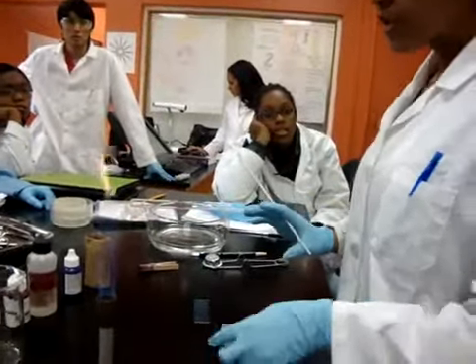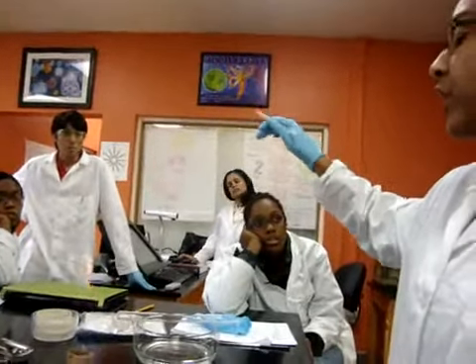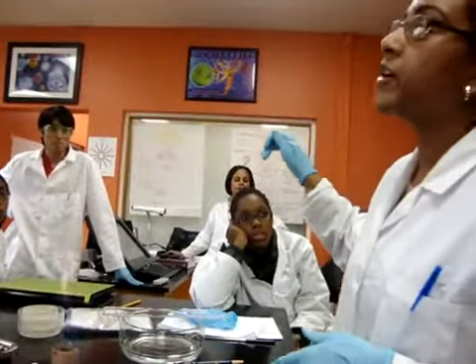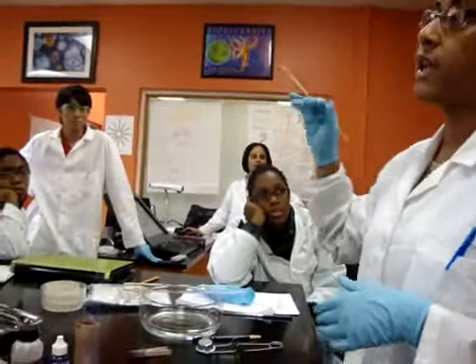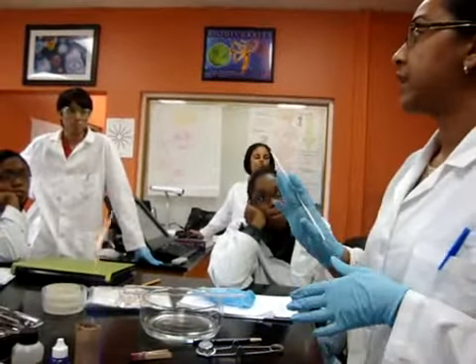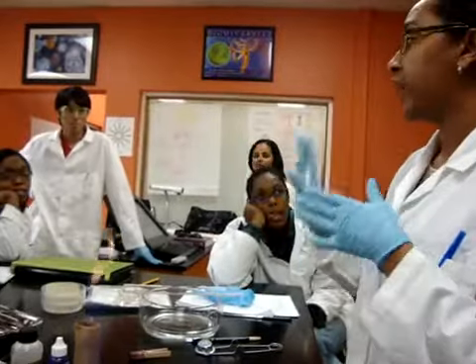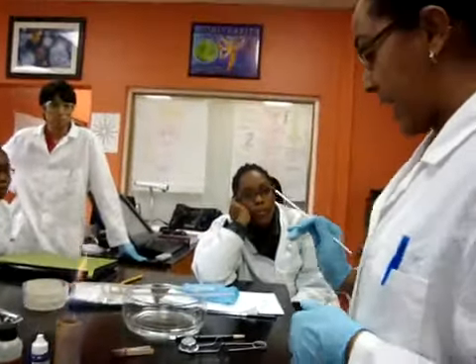In medical laboratories, they have what they call a laminar flow hood, and we have one in the back here, which is where I pour your plates to prevent spores from falling onto the plates. It has a HEPA filter in it, and it forces the air through the HEPA filter, and the HEPA filter catches all the microbes, and it pushes out pure air. But they're very expensive, so we only have one. So we do the best we can.